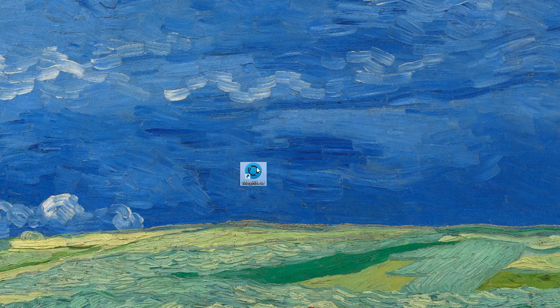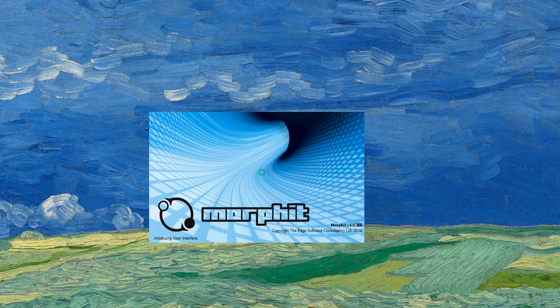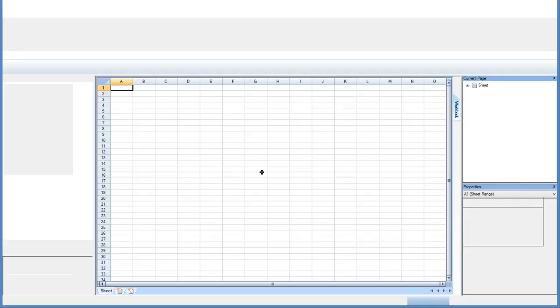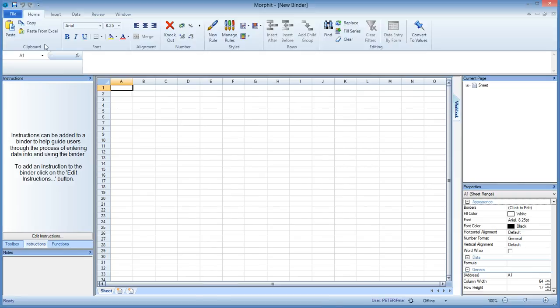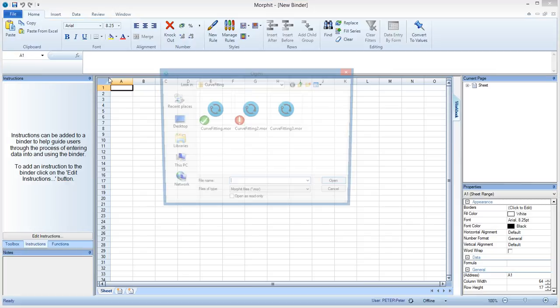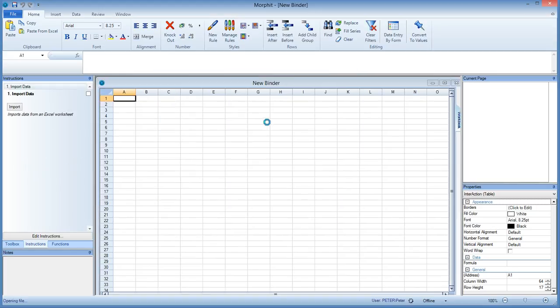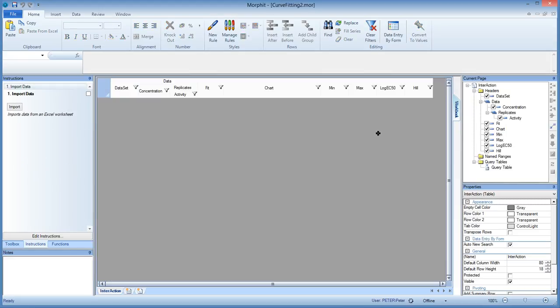So let's launch Morfit and we will then load the file where we left off after the second presentation. So this is a blank Morfit opening and now we load this file and that brings in the structure as we created in the first and the second video.